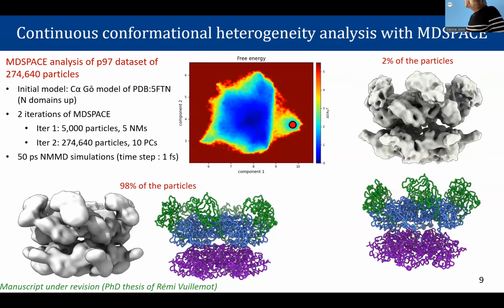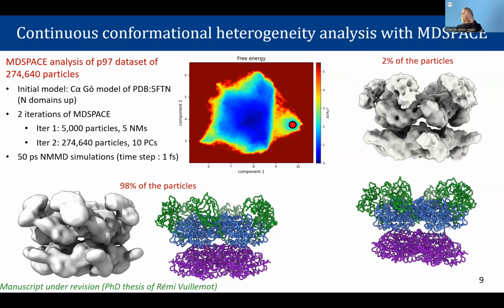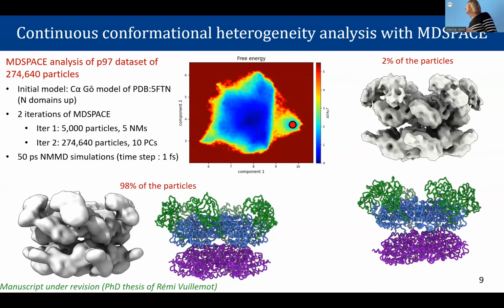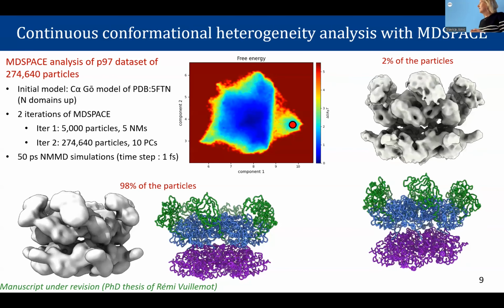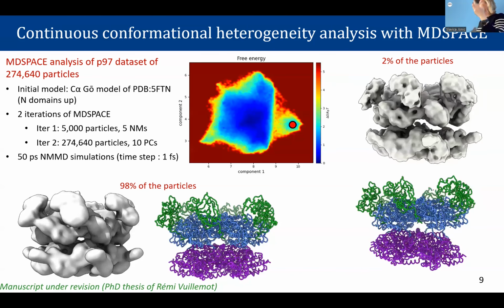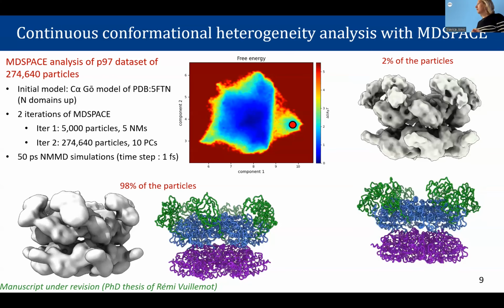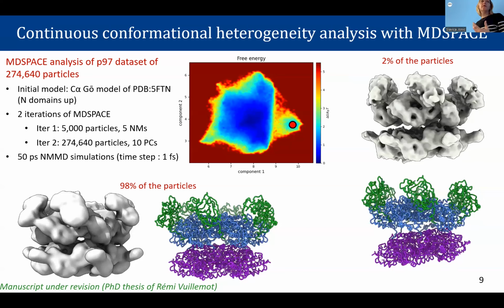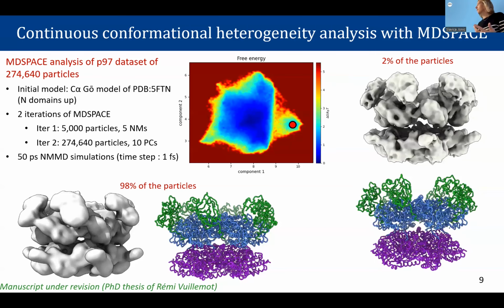Because look, for example, it looks a little bit distorted, no? I was kidding. I don't care. Yeah, I understand this can be a little bit misleading, because what you would expect is that if you reconstruct from a lot of particles, you get a less smooth object, because normally it's supposed to be high resolution.